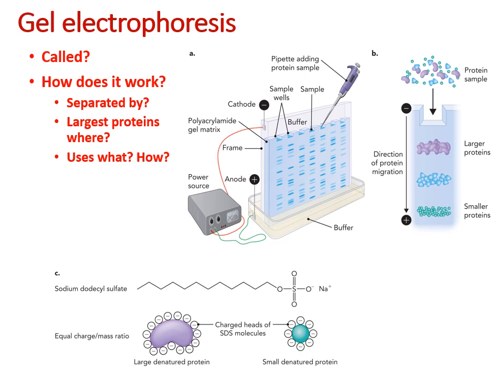The one we're going to focus on today is for proteins, and basically it's a way for us to approximate the molecular mass of a protein, and also to figure out, after you've done, let's say, a protein purification, did you get your target protein? Is it the only thing that you got in that sample? Running a gel afterwards will help you figure that kind of information out.